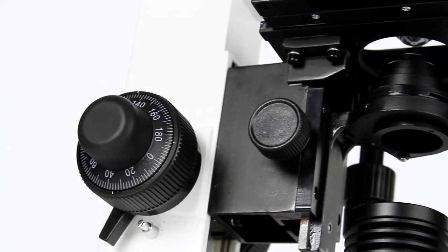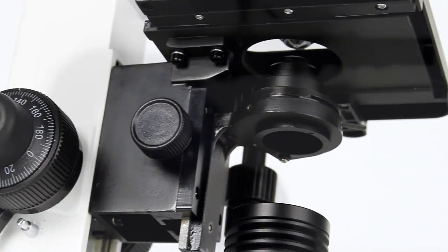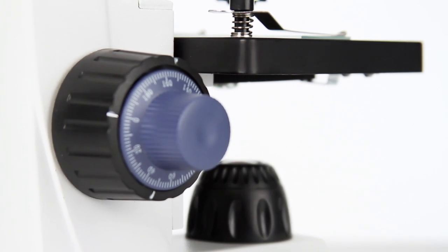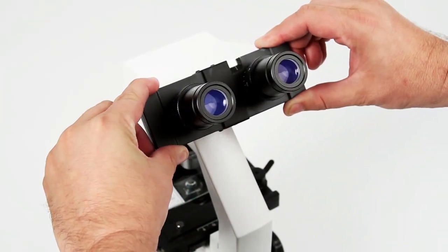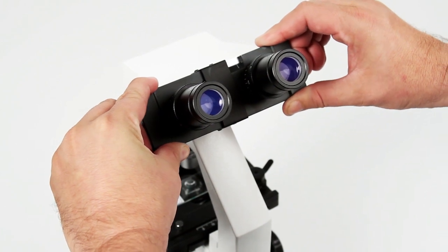Select models offer advanced features like an Abbey condenser or coaxial focus, while others are battery-powered for use in the field. Two models even offer a binocular head for comfortable extended viewing sessions.